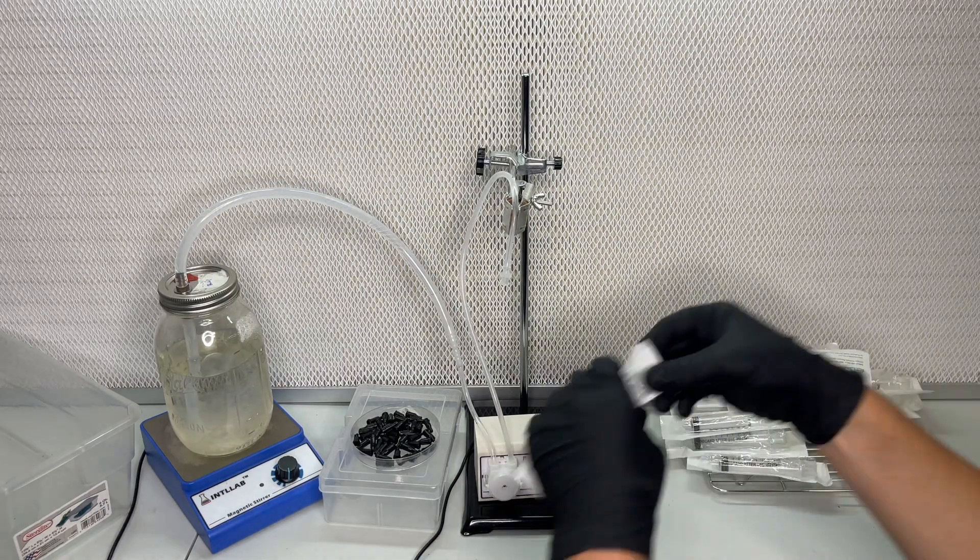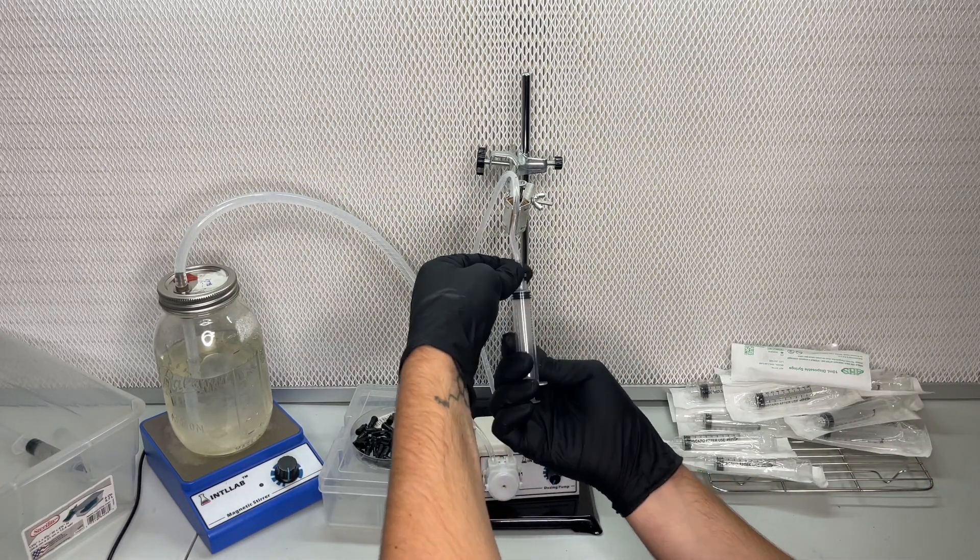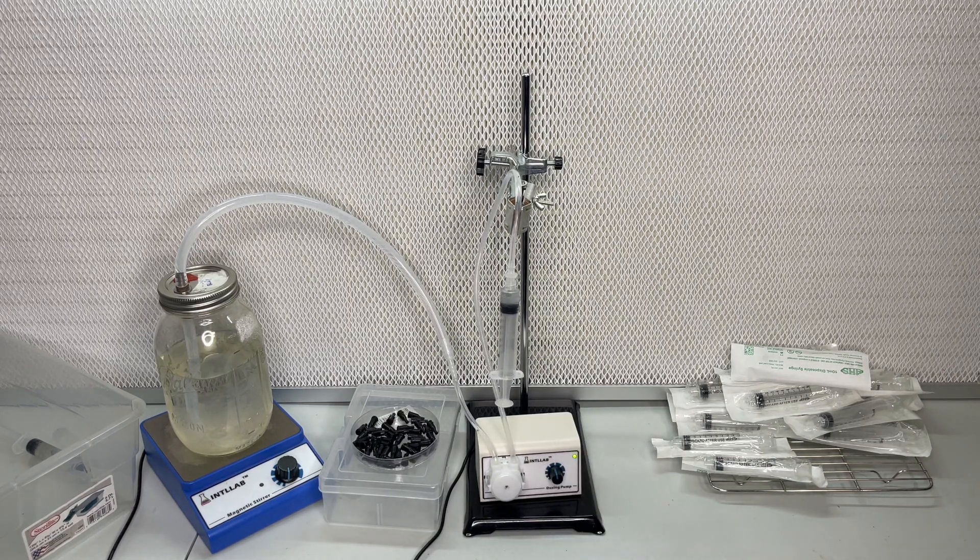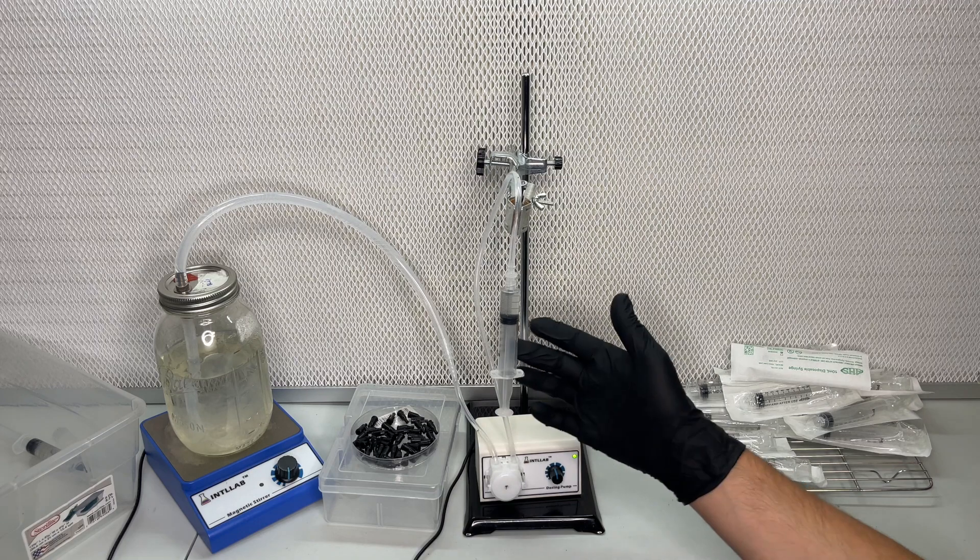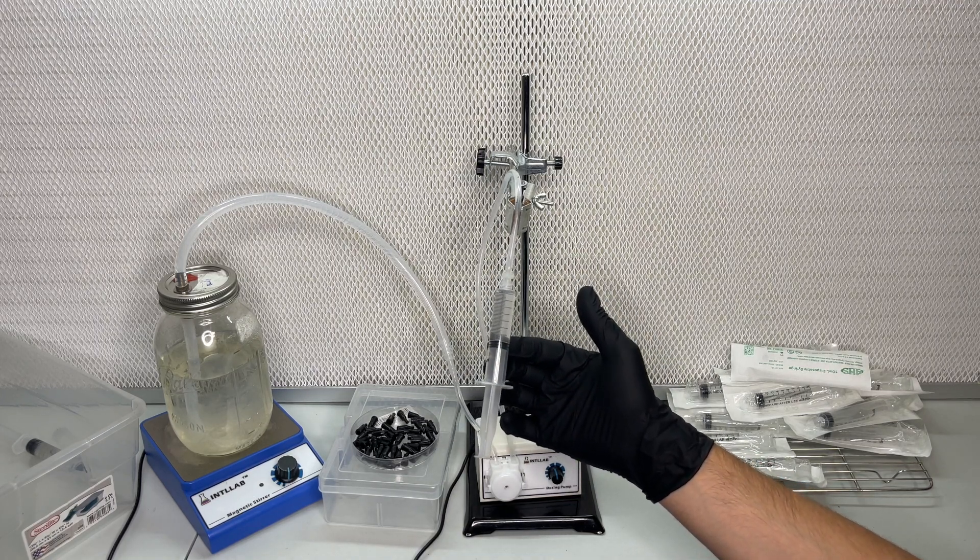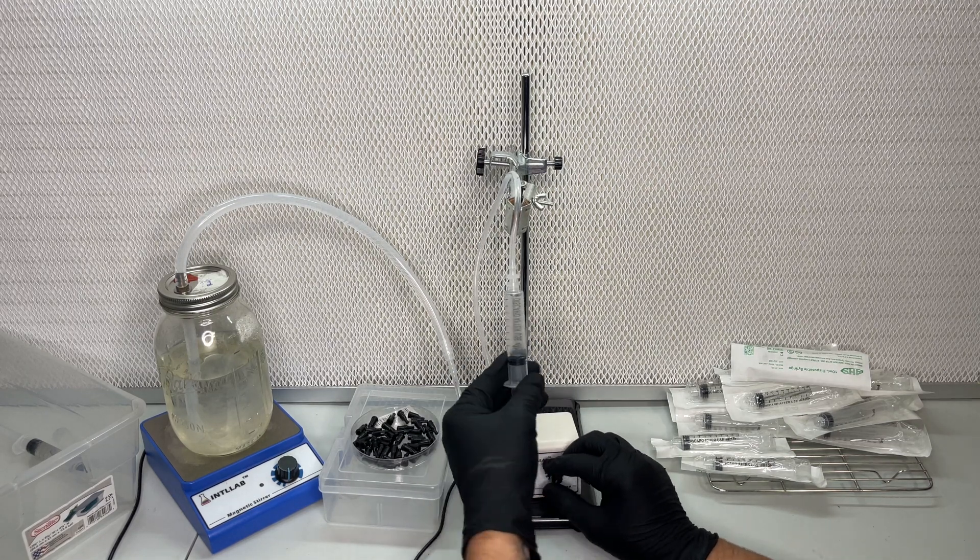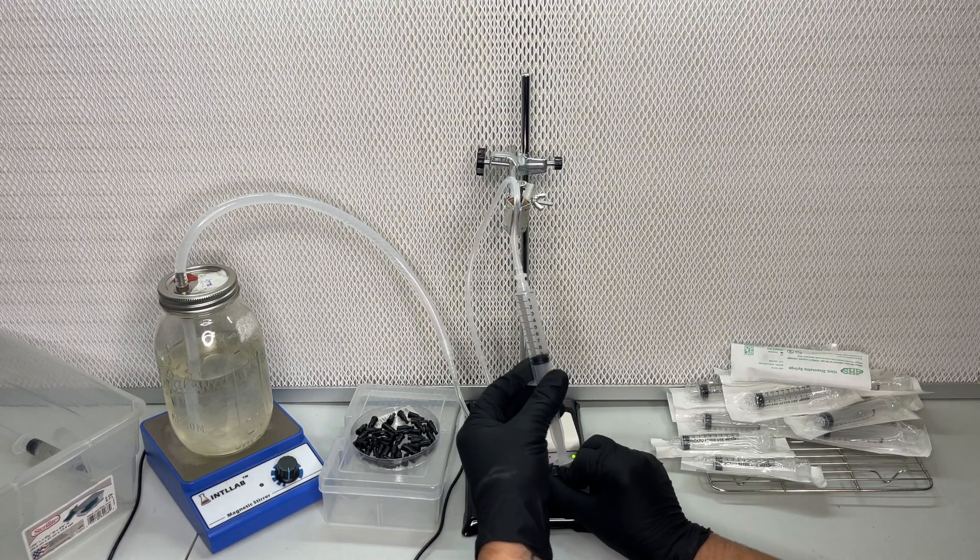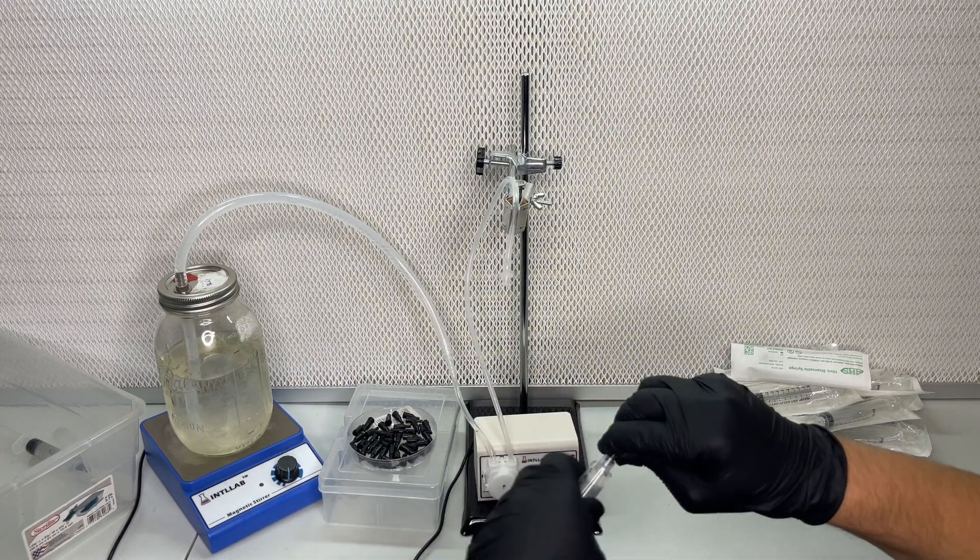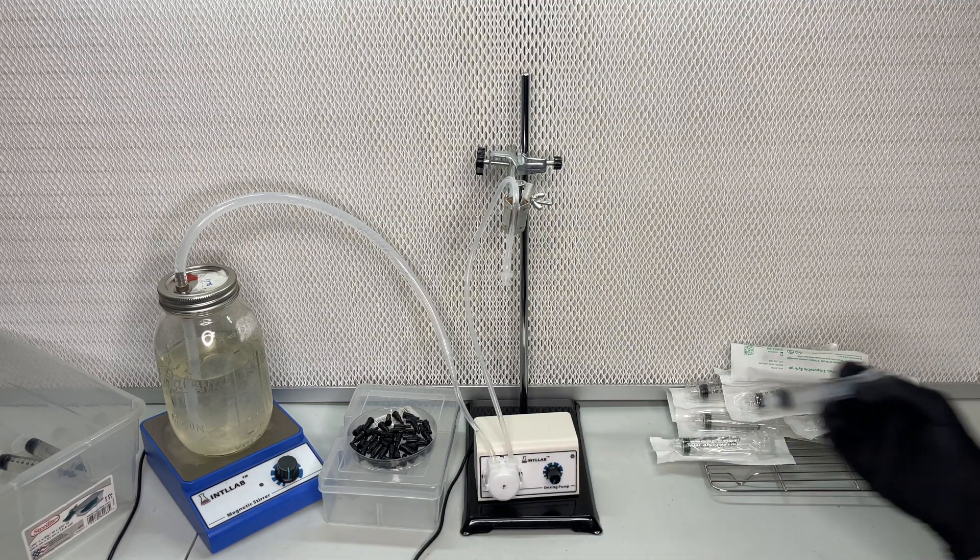Once everything is connected I turn on the peristaltic pump and purge the system into an empty jar until the liquid has reached the exit. I attach a sterile syringe and turn on the pump and it automatically fills the syringe within a few seconds. If you make a lot of syringes you know it can hurt your hand a lot, so using this method really gets rid of that problem.